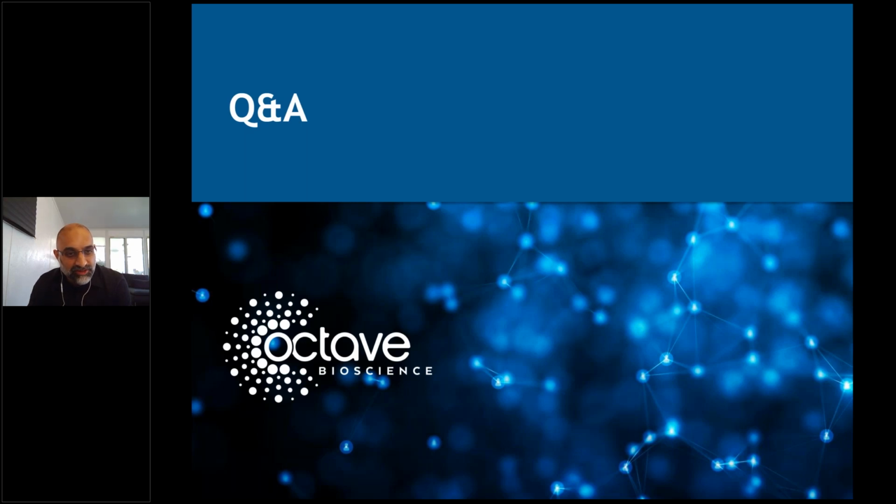Yes. Okay, so I think there's two questions there. Several of the biomarkers that are on our custom assay had been measured on other platforms as well. I think they mentioned Luminex. A Luminex-based platform was one of the earlier platforms that we utilized for our initial study. So before we expanded to the deep scan that we did of over 1,000 biomarkers with Olink, we were using a Luminex platform. And there was a good deal of overlap between the proteins that were on the Luminex platform and Olink.